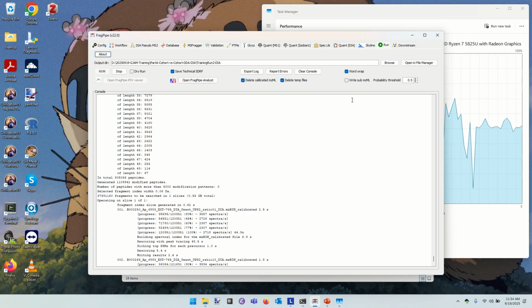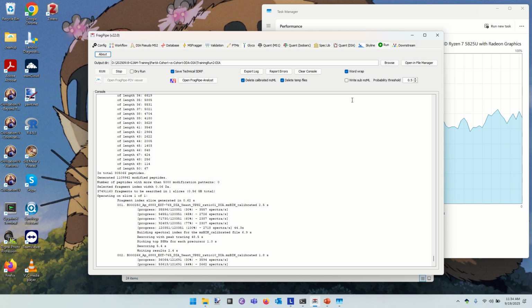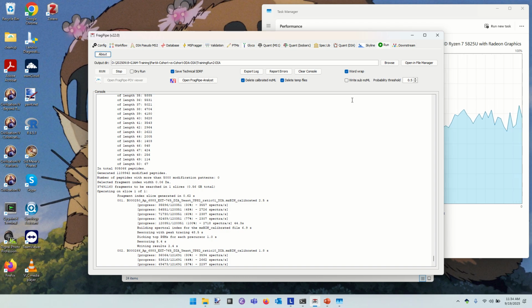And we expect that through time, we're going to have multiple MSMS scans attributed to this. So when you see something called the DIA tracer going on, I guess after this stage, it's partly trying to stitch together this time dimension for the fragments and the precursor ion that represent a given peptide.